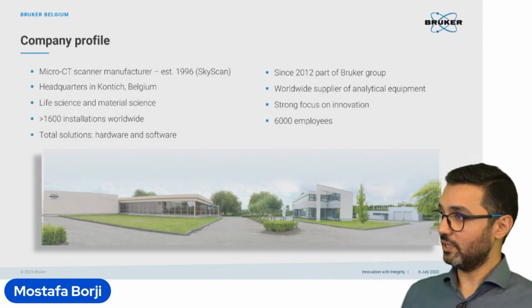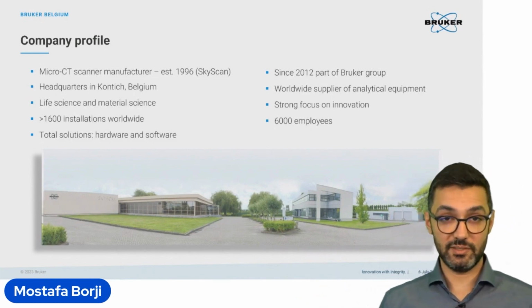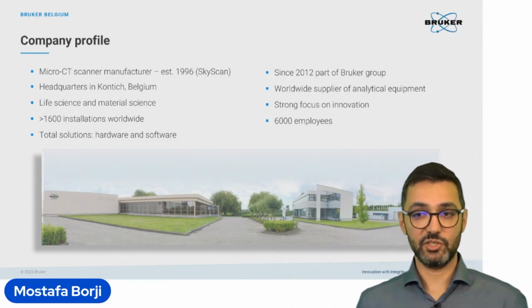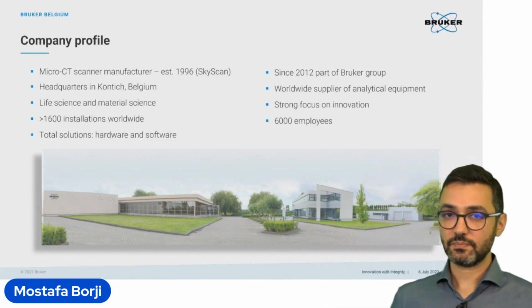And not only the hardware, the devices themselves, we also provide software to do the analysis and the reconstruction. I will explain about this a bit later.